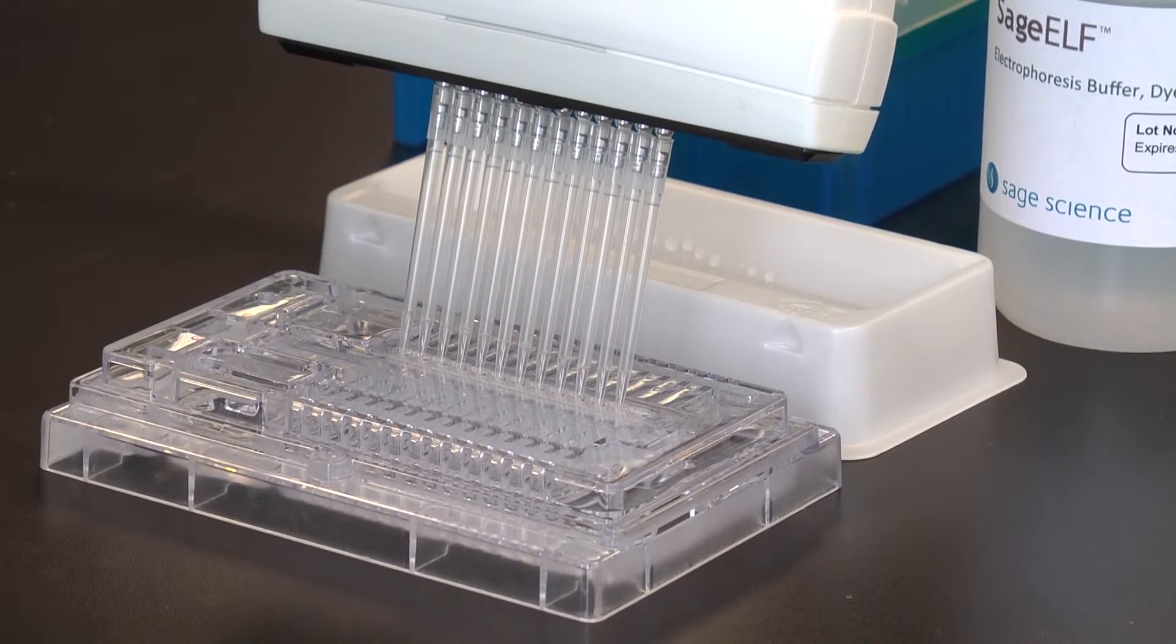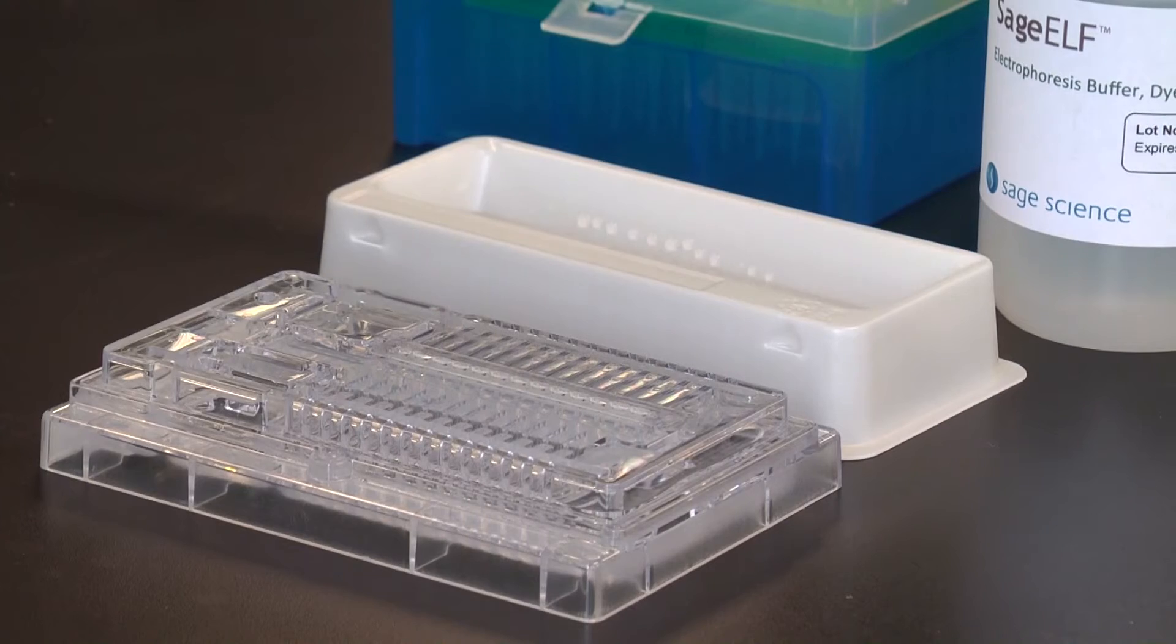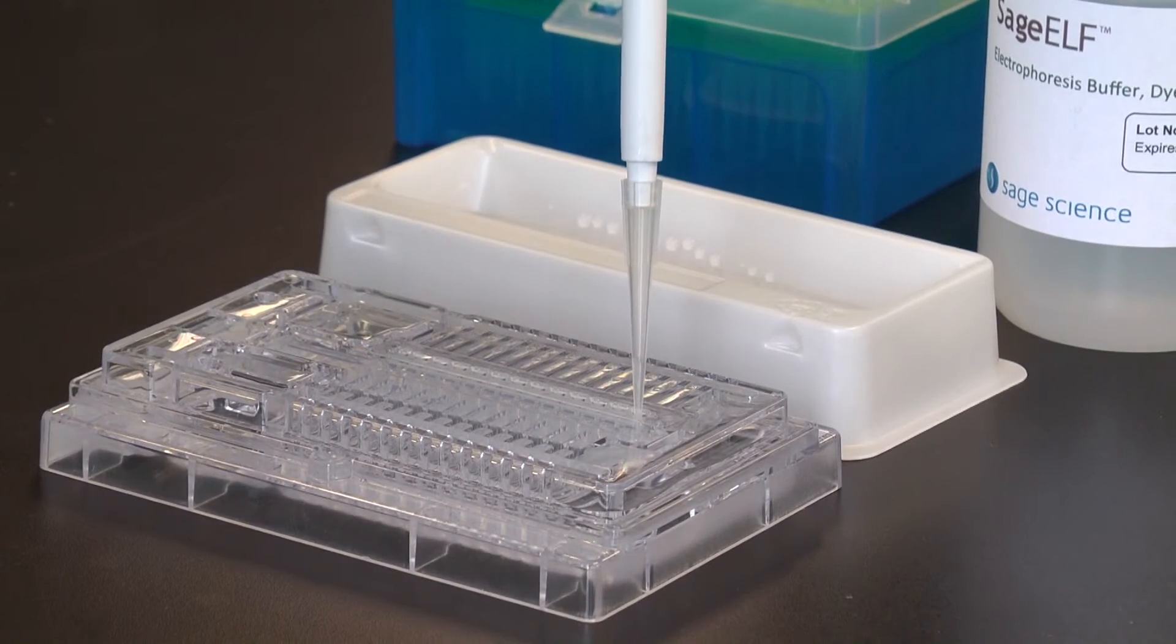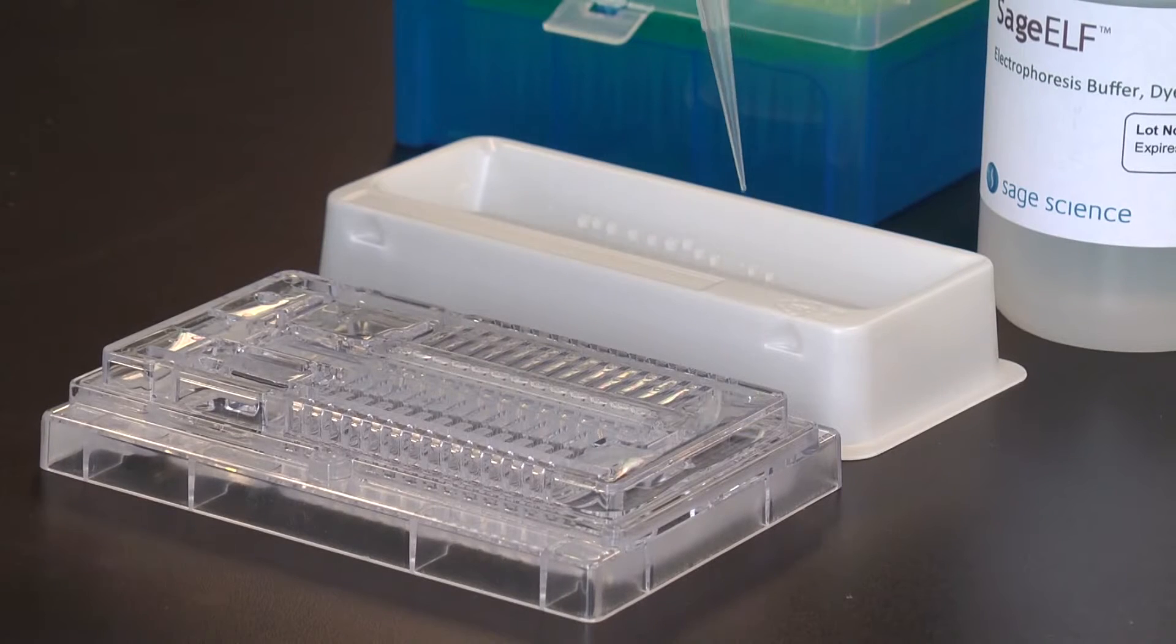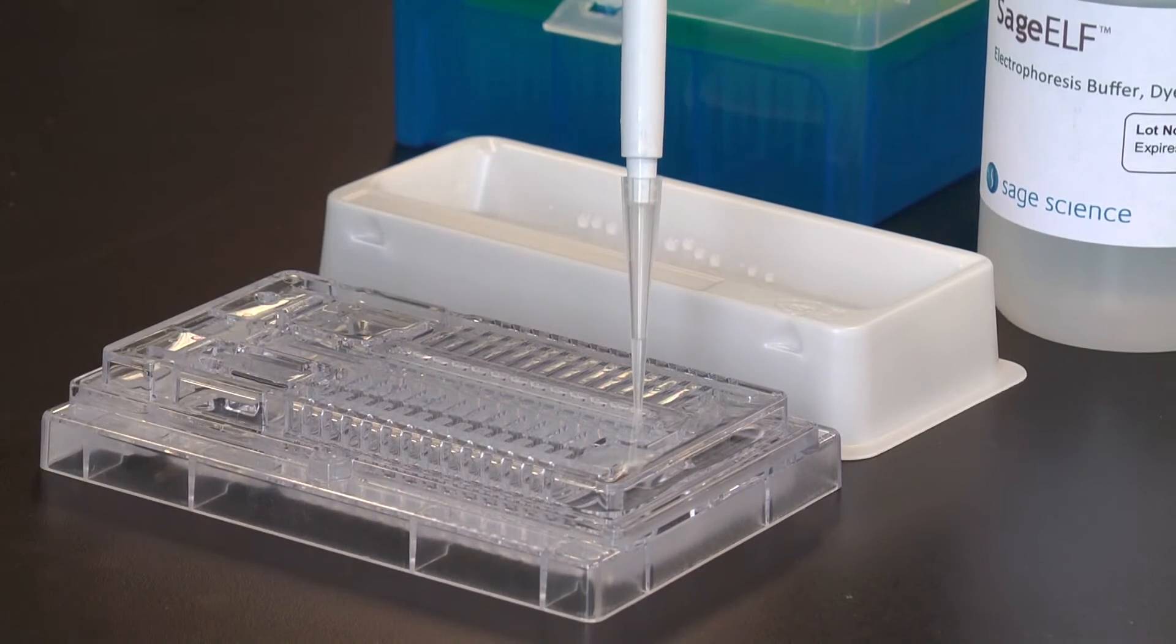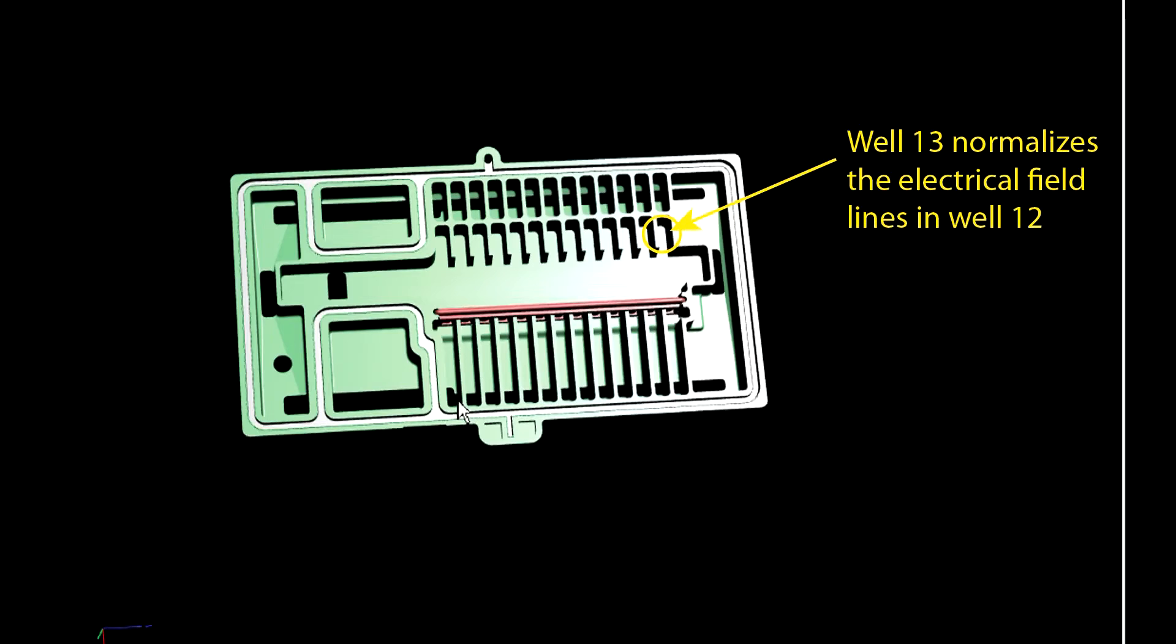Use a P100 pipette to replace the buffer in the final thirteenth well. This well is included in order to maintain the proper field strength in well number twelve. It may be used to collect an additional fraction, but it is not accounted for in the software calibration.